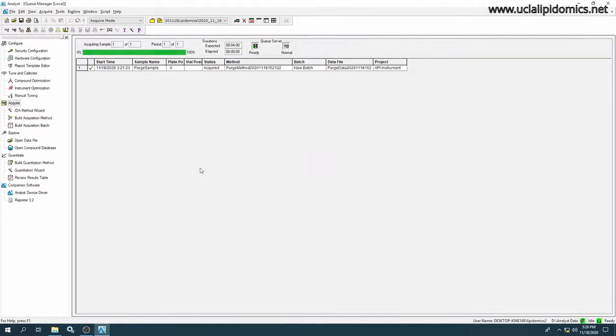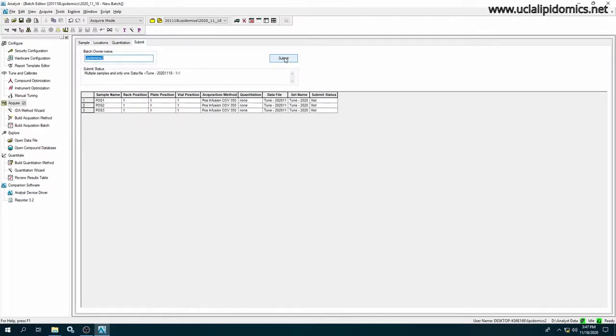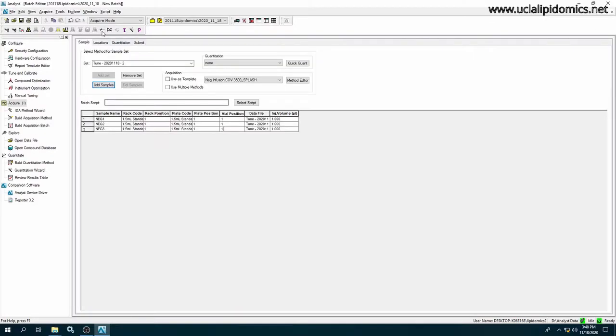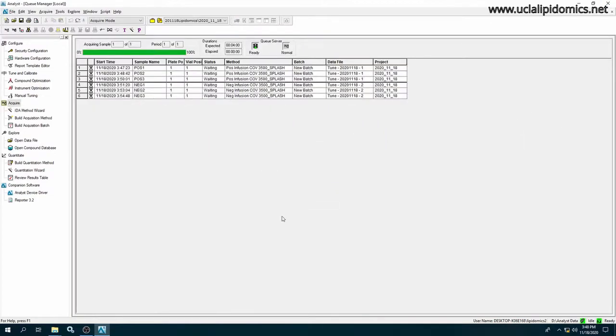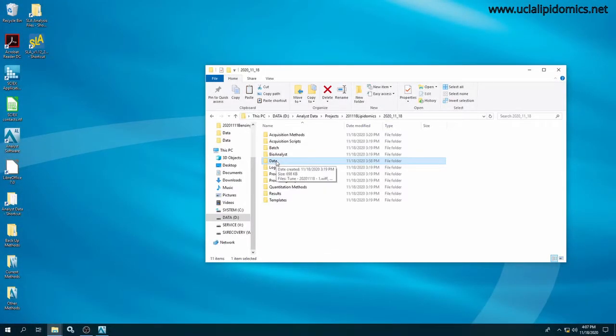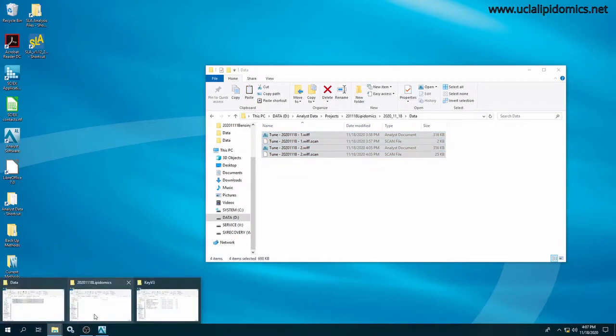It consists of 3 consecutive runs of the positive and negative compensation voltage ramp program. These programs are run while the tuning mix is being supplied by the syringe pump. The Assistant will analyze the tuning data and use it to update the methods we are about to run.